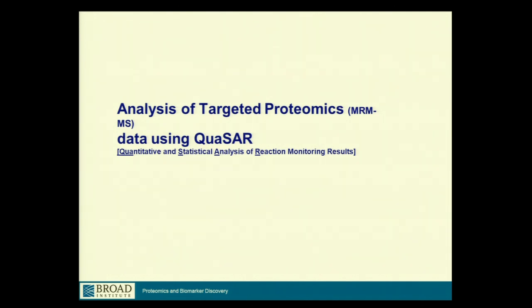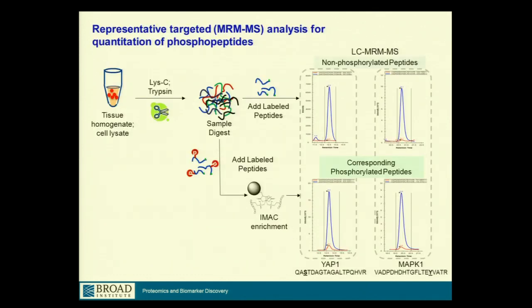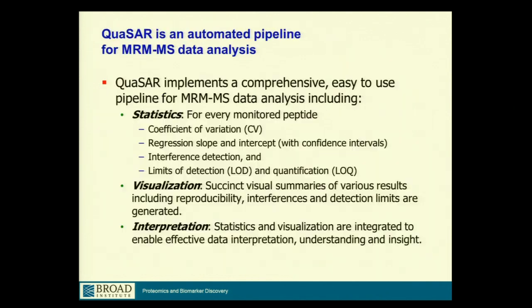And you want to be able to say how good your assay is in terms of linearity, limits of detection, how low it can detect in terms of the samples that you're going to provide, things like that. So you want to qualify your assay to begin with, and then you want to apply the assay to samples. For that, I think you have seen this flow, or Sue is going to talk about it if you haven't. This basically says how you run an MRM-MS experiment. I won't go into it, it's just a placeholder.